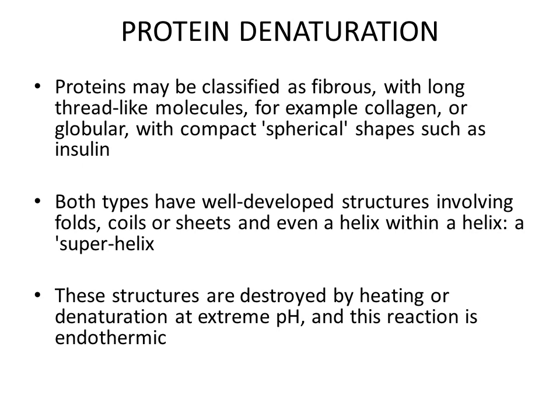Both types have well-developed structures involving folds, coils, or sheets, and even a helix within a helix, which is called a superhelix. All of these structures are destroyed by heating or denaturation at extreme pH, and this reaction is generally endothermic, and it can be studied by DSC.